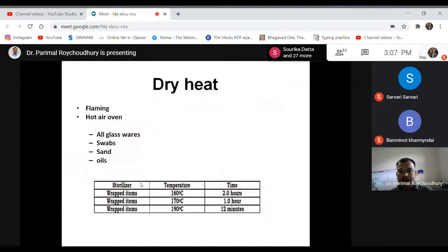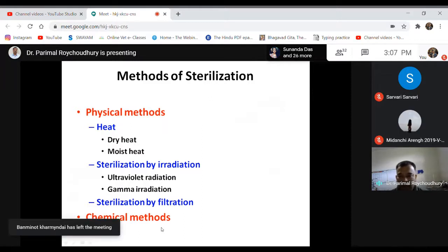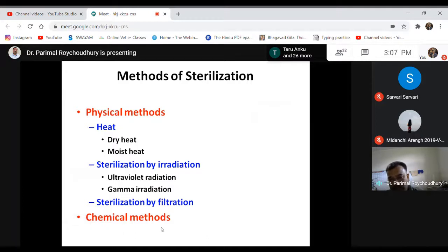I guess I prepared it up to this part, and lastly, these are the techniques that we commonly use. The chemical methods are not very much used, but mostly we use them for disinfection purposes. For example, we use an alcohol solution, 70% ethanol, for disinfecting our hands, cleaning the work surface before any bacterial isolation, or cleaning glass slides. And some chemicals like phenolic compounds, we use for disinfecting the floors and the workbenches.